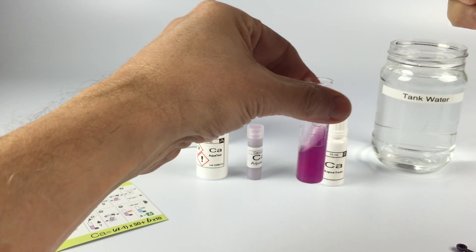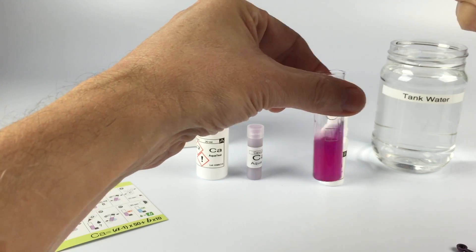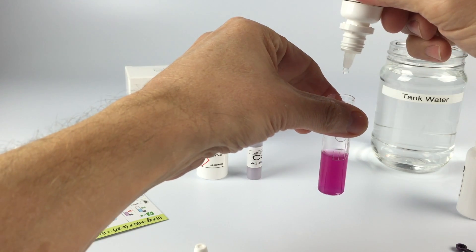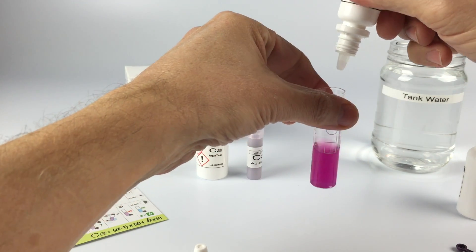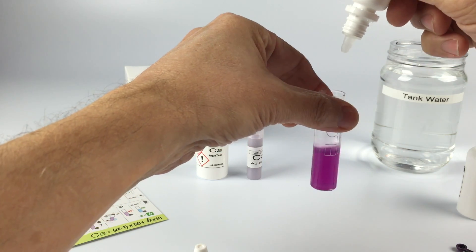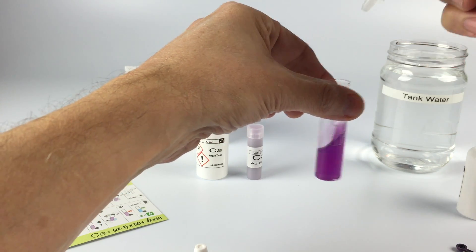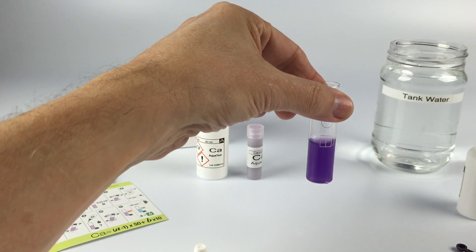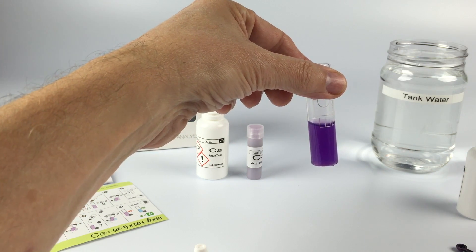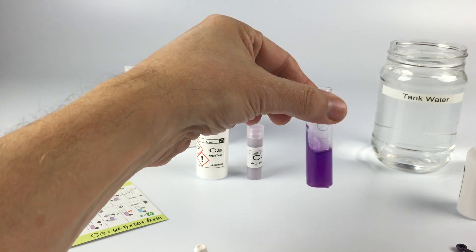7 drops of Part C accounts for up to 350 parts per million. Each drop of Part D will be 10 parts per million. 360, 370, 380, 390. Pretty much 400 like we said before, but this is the precise way of measuring. We're waiting 20 seconds to make sure it stays blue. If it's not blue enough, we'll add another drop, putting us at 410 parts per million.